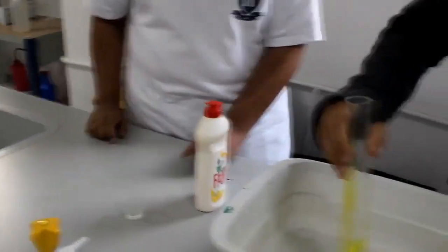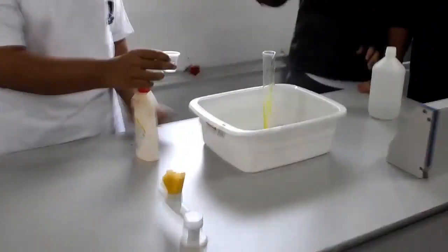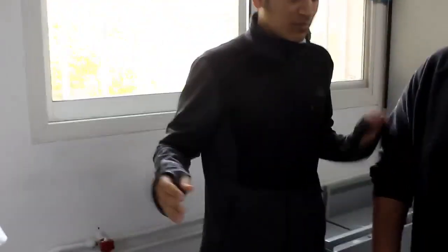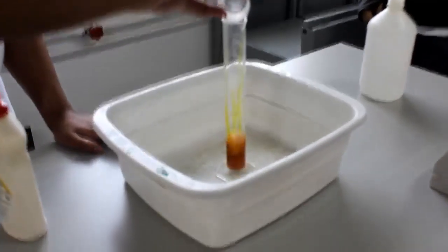Now we will mix the mixture a little bit. And now we will pour the potassium iodide. When we pour the potassium iodide, it will go up in foam. So once he pours it, we will have to stand back. Go. Stand back.